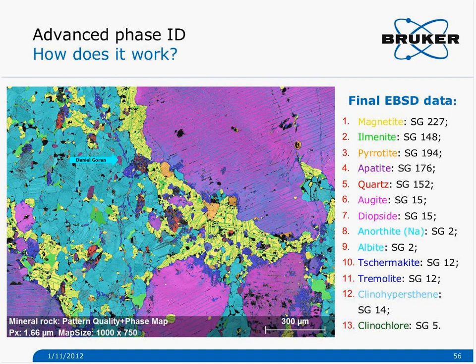So in the matrix iron and oxygen, and then you have a very small particle which contains some elements, but also iron and oxygen. Then when you do the phase search using the search engine, you may try many possibilities. You can try to remove iron from the matrix, or iron and oxygen as information given by the matrix, and also search based on the other elements.